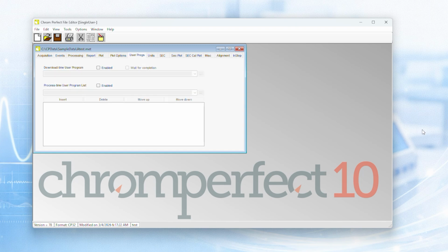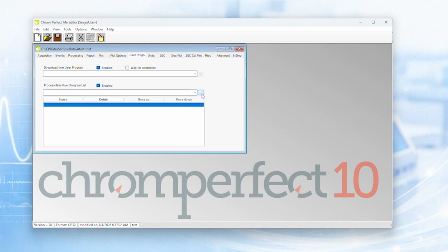Next is the User Programs tab. User programs allow external programs or automation routines to be triggered during acquisition or processing. This feature is powerful in automated laboratory environments. For beginner workflows, it is enough to understand that this capability exists. It is not required for standard acquisition and analysis.